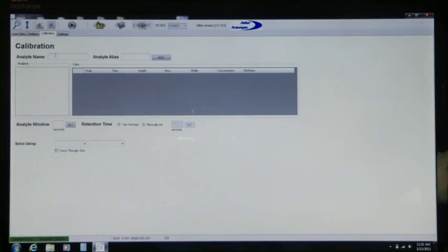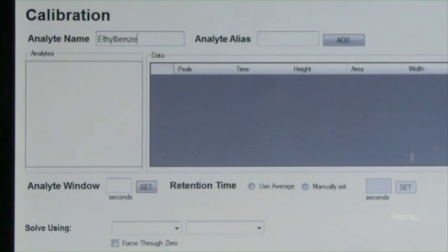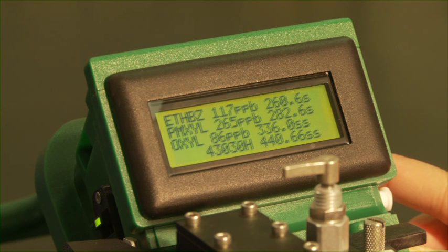In the calibration window, you can enter the names of all the analytes in your standard. The alias is the shortened name for an analyte that will appear on the Frog's screen when it is running independently of a computer.